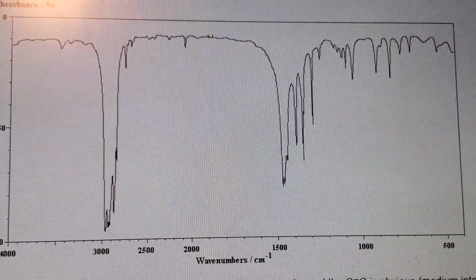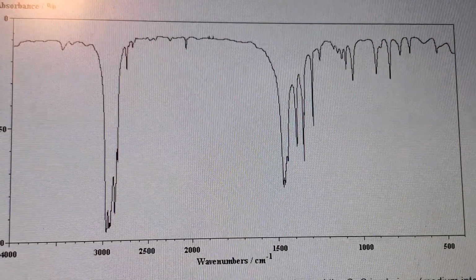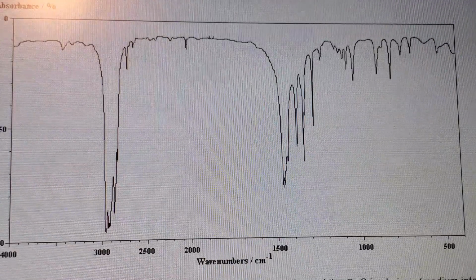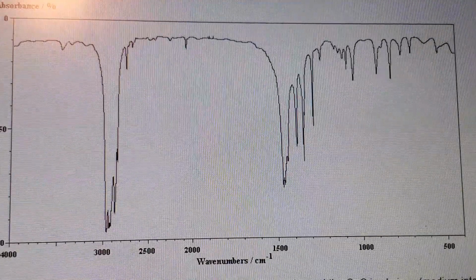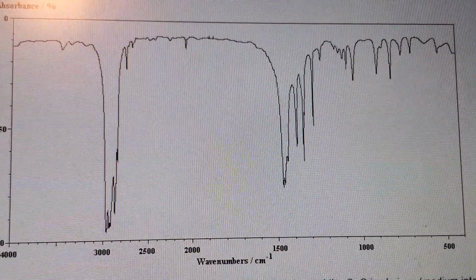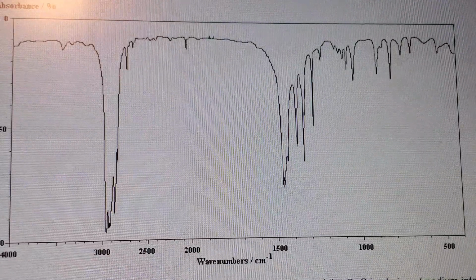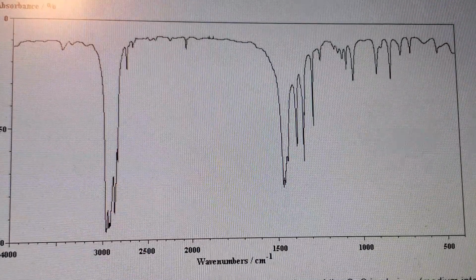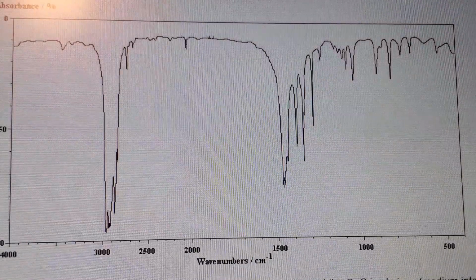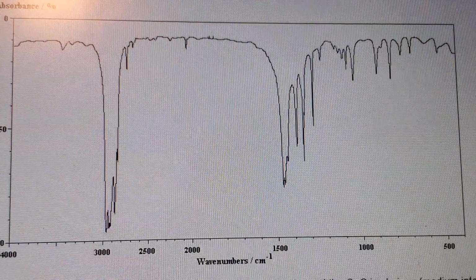How do you know? This is not very convincing. That's why you need to use multiple pieces of information. So if you have any other piece of information, you have to use it. Okay, I think I will come back to this, so please bear with me. But with a little other information, such as NMR or UV data, you can easily do it.